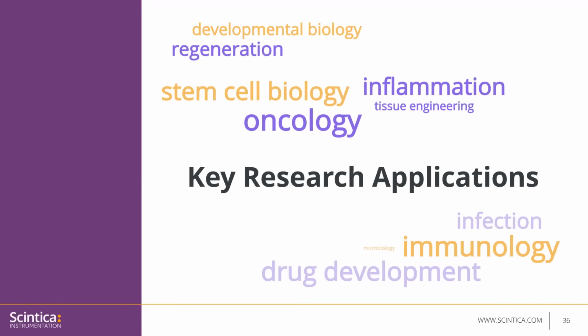There are also really good mouse models out there of inflammation and infection, allowing for intravital microscopy research of that. And using more often the zebrafish and fruit fly models, developmental biology and regeneration are being studied with intravital microscopy. And more recently, there's more research being done on tissue engineering and microbiology with the method.